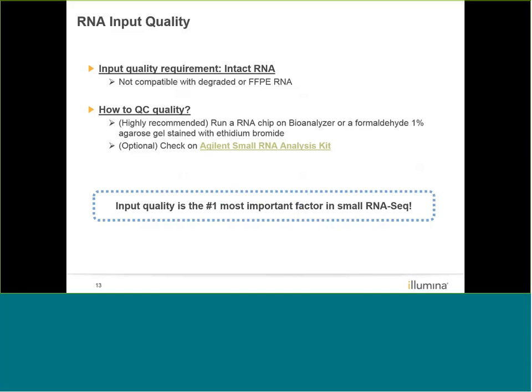Overall, the input quality is the number one most important factor in RNA sequencing and small RNA sequencing. It's just because the quality of your RNA depends on whether you can use the kit and how much input you start with.